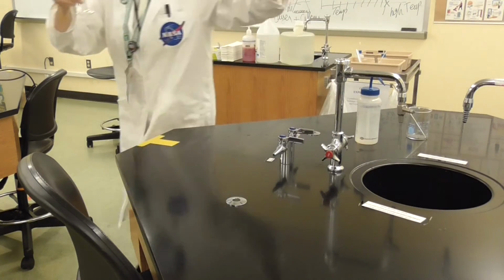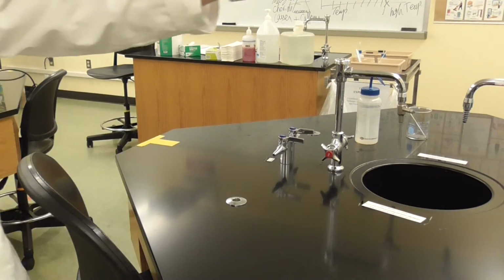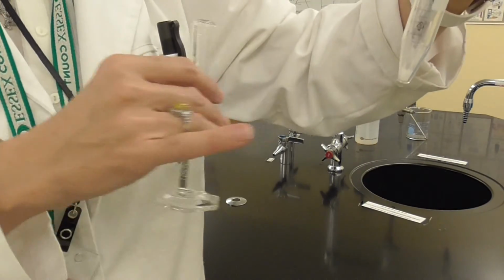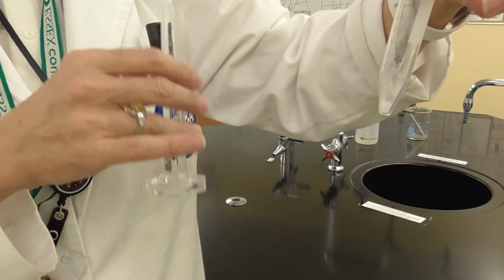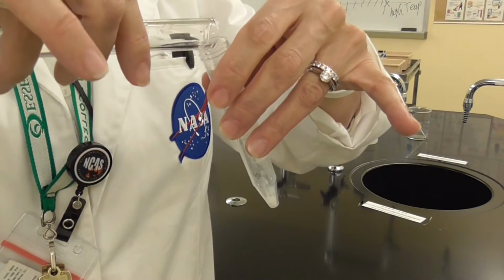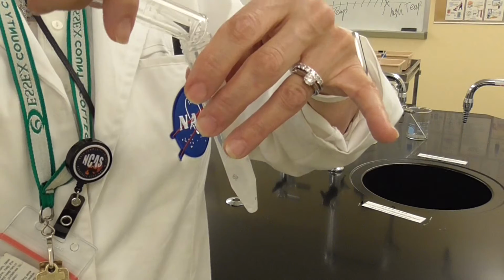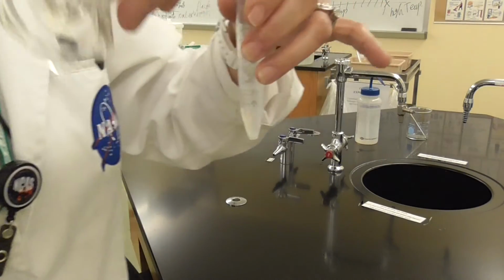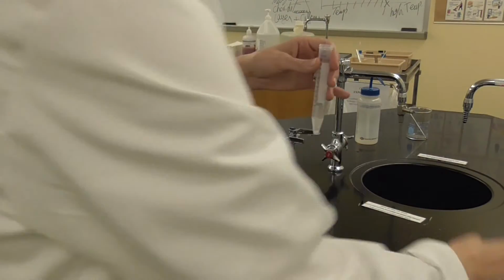Okay. Can I have it? So this is basically what we have. We have 70 milligrams, which is 0.07 gram. We added the 4 milliliters of water. Can I have the cap?